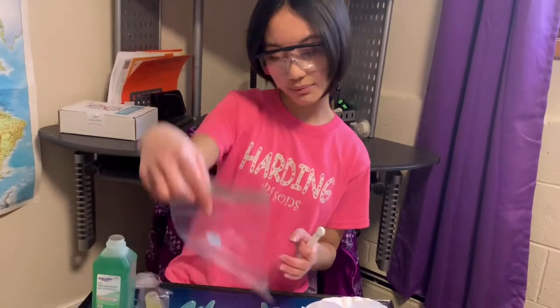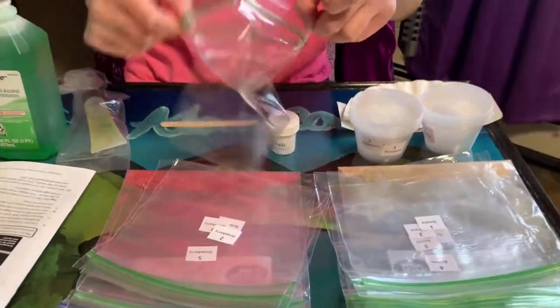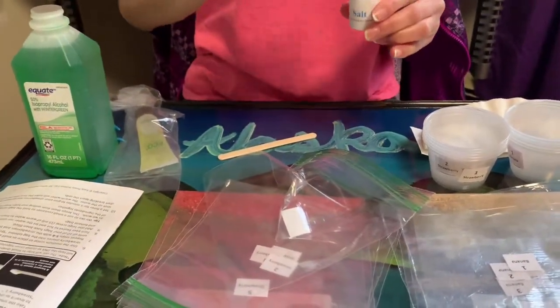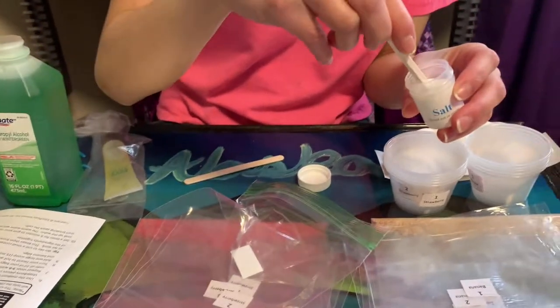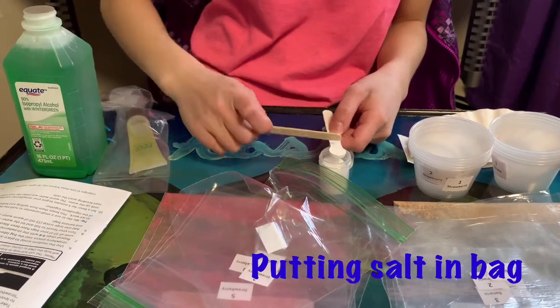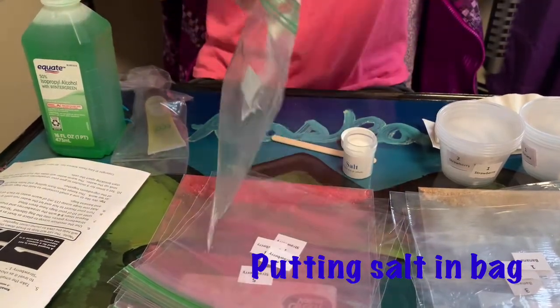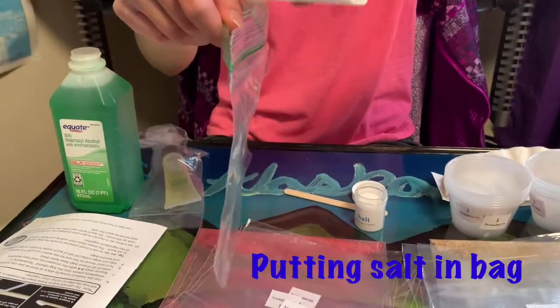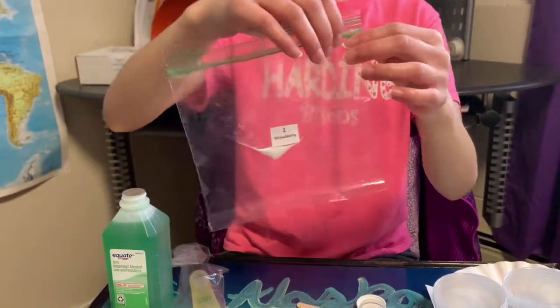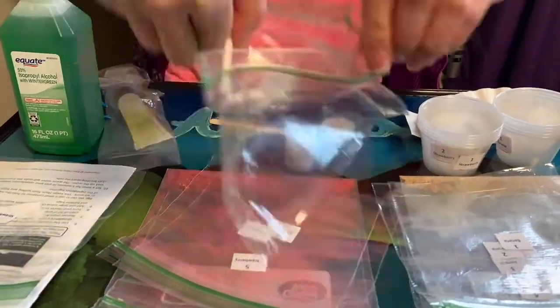Alright, so bag number one, strawberry. We're going to put salt in there. Use this to take any extra salt out. So here's number one, strawberry bag. Okay, and then we close it so it won't spill.